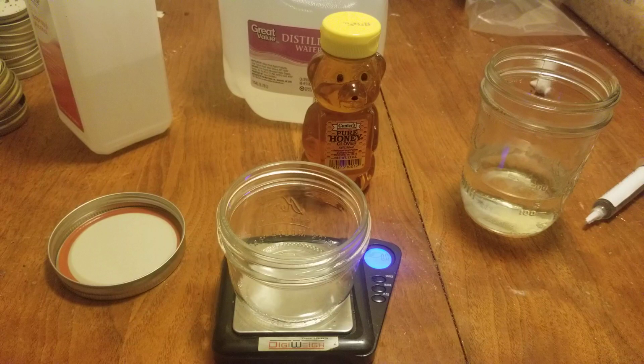And you would get some number like 6.0000 or something crazy like that. The 6 is how many grams of the honey or the light corn syrup you would add. I believe if you were to use 400 milliliters, it would be approximately 16 grams, if my math is right. I'm going to check my math after I do this, and either you'll see something on the screen that says I was wrong, or if I'm right, you won't see anything.